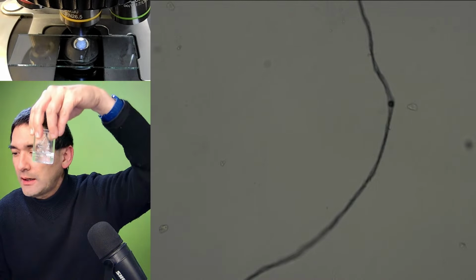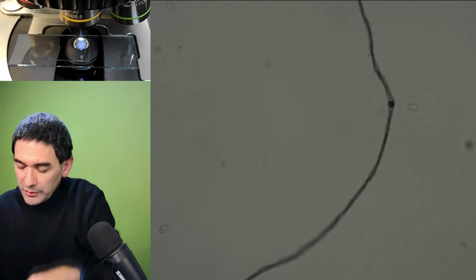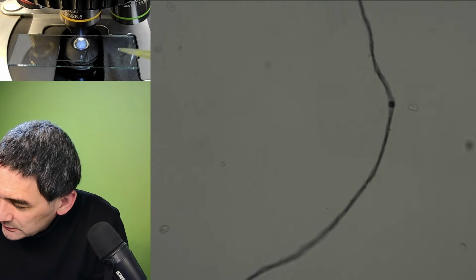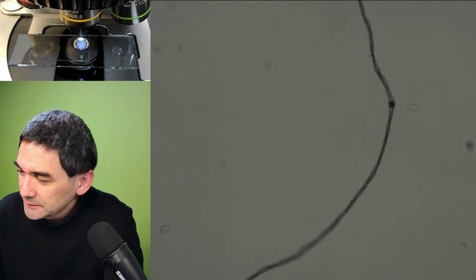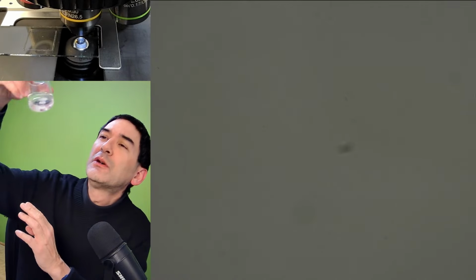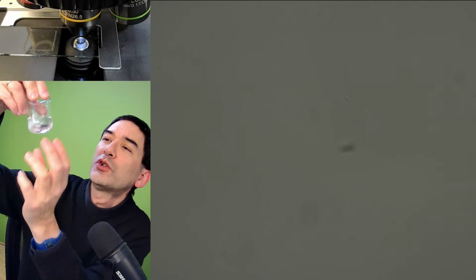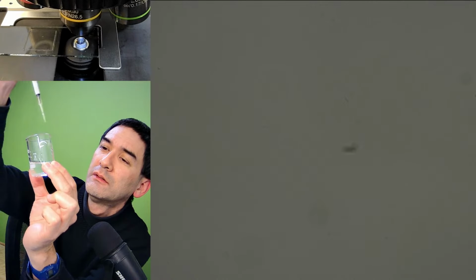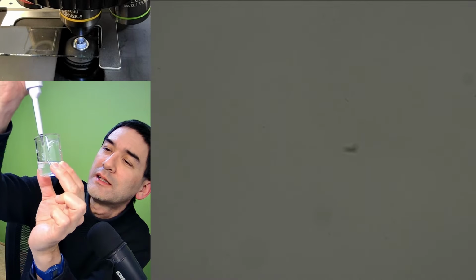Not that I have basically shown you the. Let me try this here. Okay. Oh my gosh. Okay, so this is what you call a demonstration effect, because I see so much stuff floating around here, but I was not able to catch anything. That's kind of interesting.